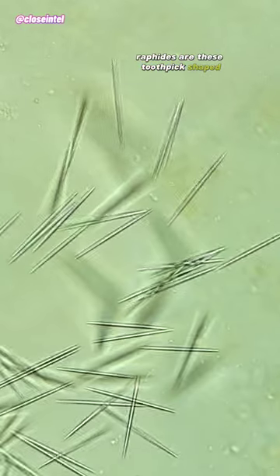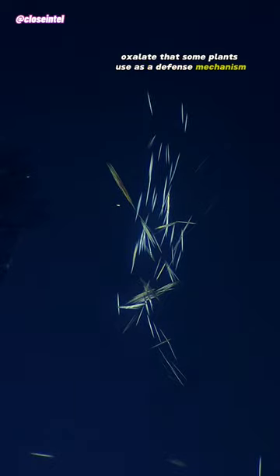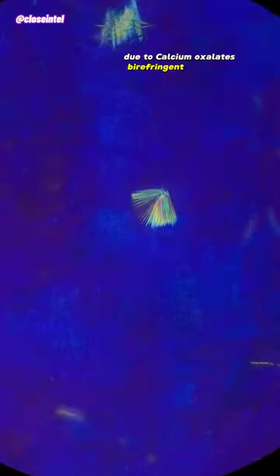Raphides are these toothpick-shaped crystals made from calcium oxalate that some plants use as a defense mechanism. If we take a look at them under cross-polarized light, they start to glow due to calcium oxalate's birefringent properties.